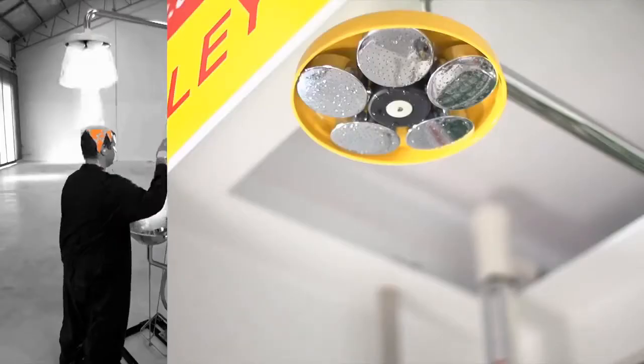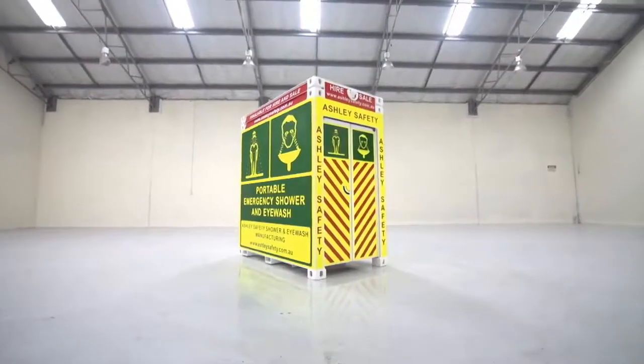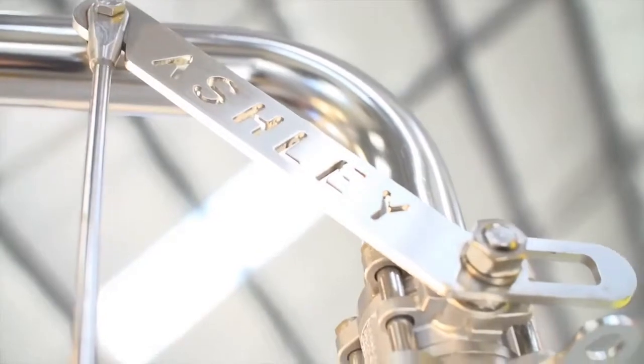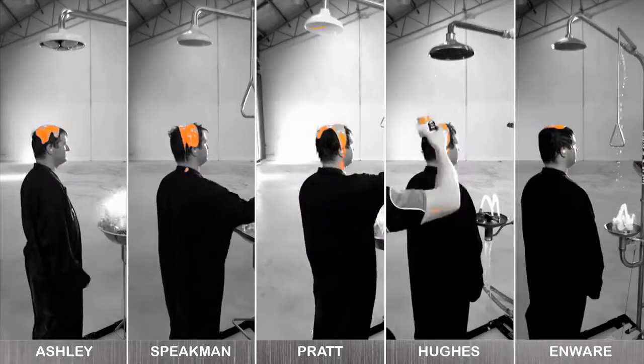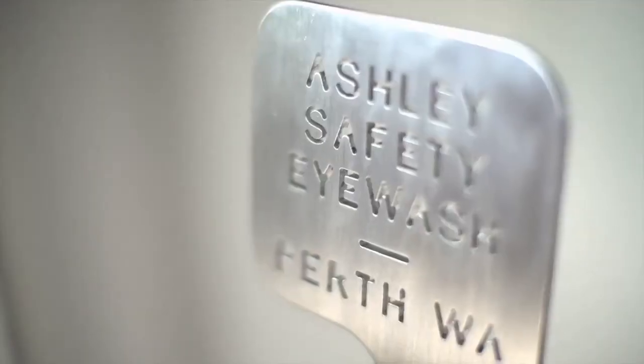Hello and welcome to Ashley Safety. Today we're going to demonstrate the superior build quality and design of the Ashley Safety Shower. We're going to examine each part of Ashley's shower and compare it to four industry competitors, and finally we'll conduct a simulated chemical burns test to see which of the showers really does perform under emergency conditions.